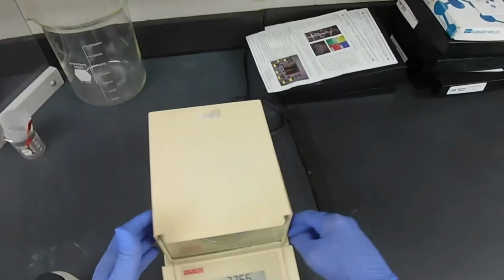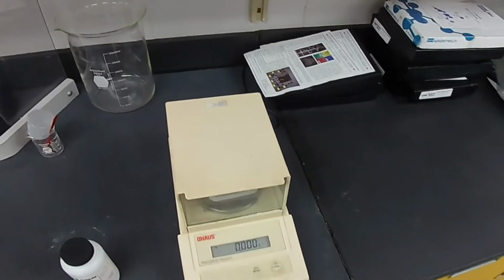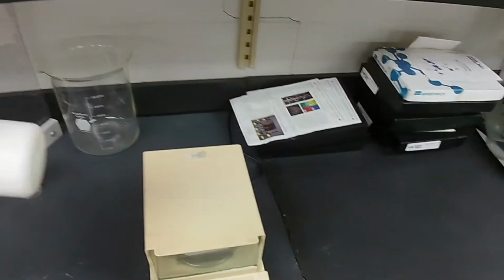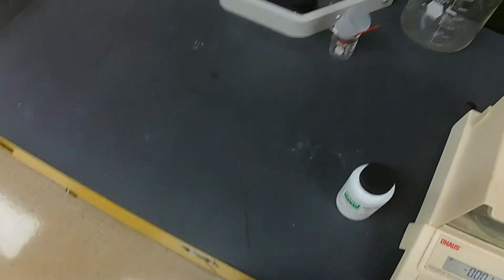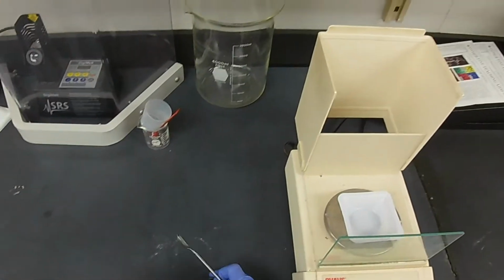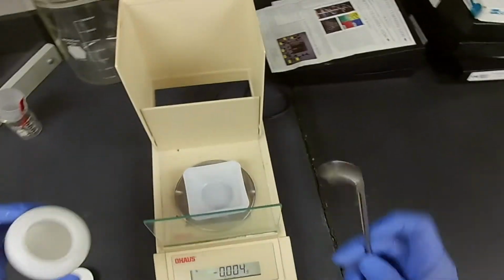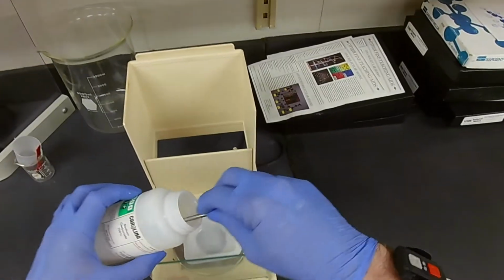All right, so first thing you do, of course, is zero the balance with your container in it so that anything we add we know is the reagent. Okay, I'm going to use my spoonula, and we need 10 grams. 10 grams here. All right. It's going to bounce around because of air currents.